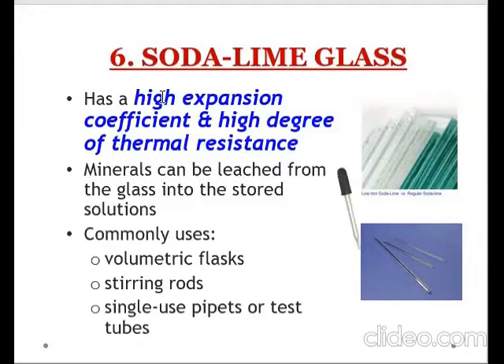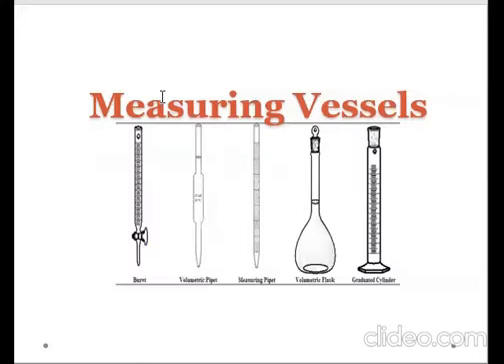So, what I'm going to do now, the next part is about measuring vessels. Para hindi po masyadong mataas ang video na ito, para pwede siyang maputol, ang gagawin natin, I'm going to cut this video. And then I'm going to make another video which will focus on the measuring vessels.